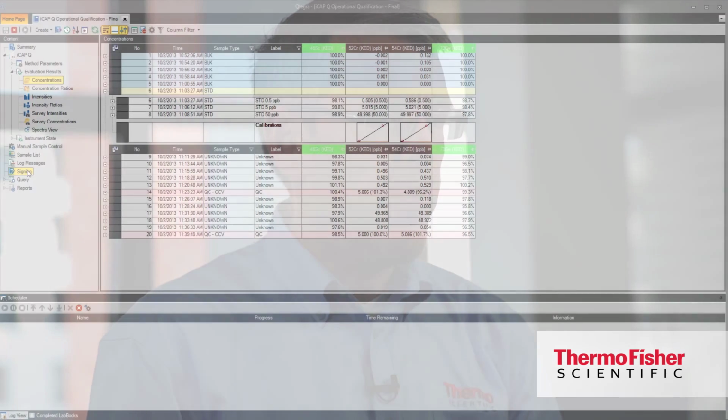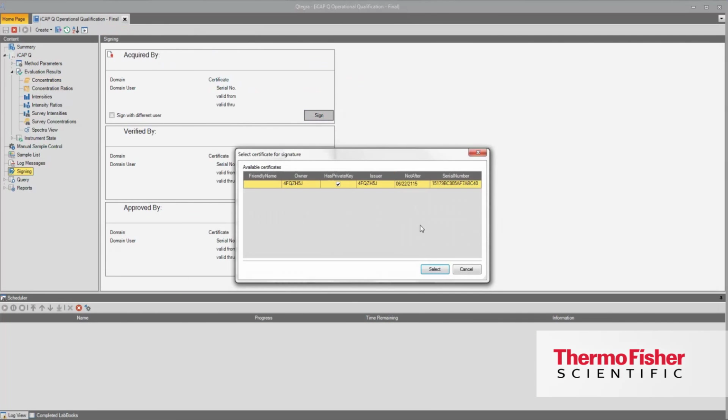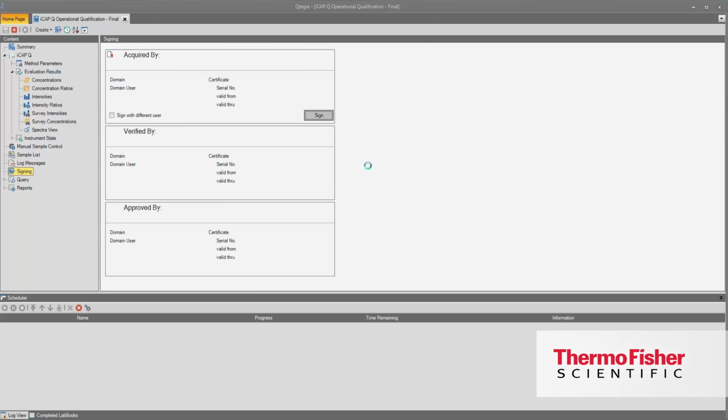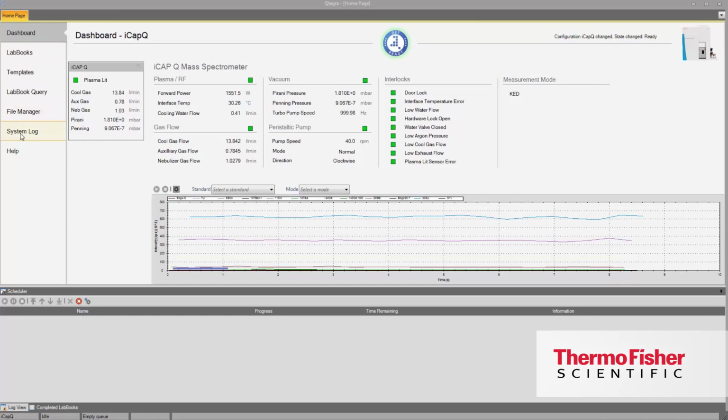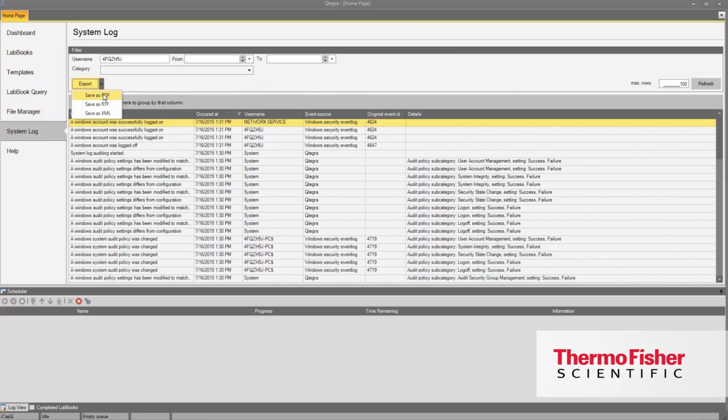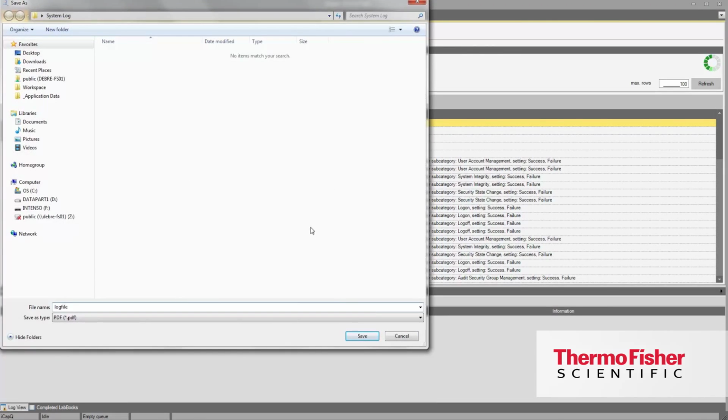Prescriptive dilution can be used in two ways. It can be used to dilute a sample, but it also can be used in some applications, for example, USP applications, so United States Pharmacopoeia. Qtegra takes compliance very seriously. So for example, working with 21 CFR Part 11 compliance, we provide a range of tools for customers in compliant environments to generate acceptable data. This is at the level of data security, but also in terms of reporting and exporting of data into individual platforms.